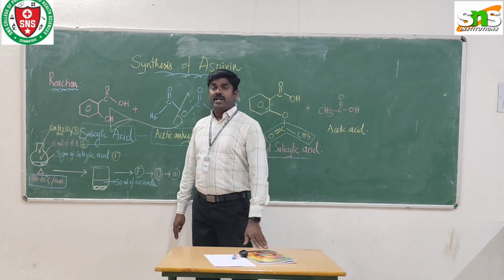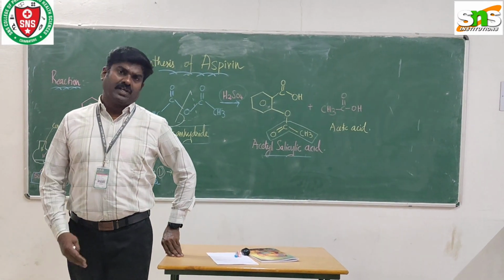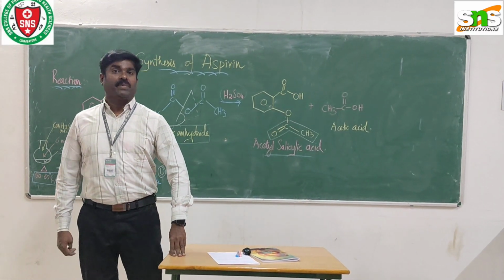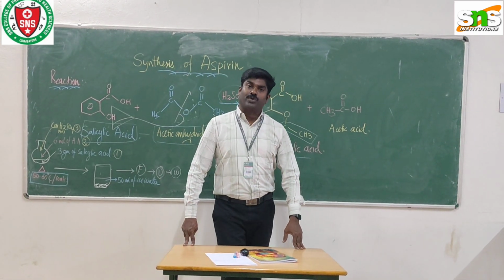How do we perform quantitative estimation of aspirin? We can use the UV ultraviolet spectroscopy method, or the HPLC, high performance liquid chromatography, technique.